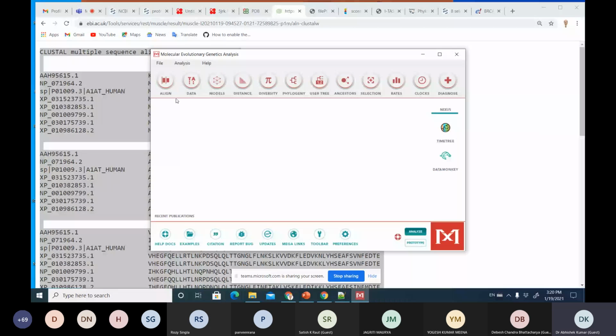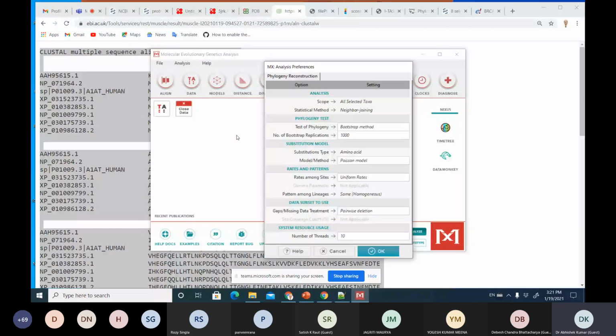So I'm going here and I'm saying there are different phylogenetic tree building methods, neighbor joining method, maximum parsimony, and maximum likelihood. So we'll just make one of the trees, and the MEGA file is required. So it's asking for 1000 bootstrap. I'm saying yes, just running it, and you will see the tree. So this is the fastest method.